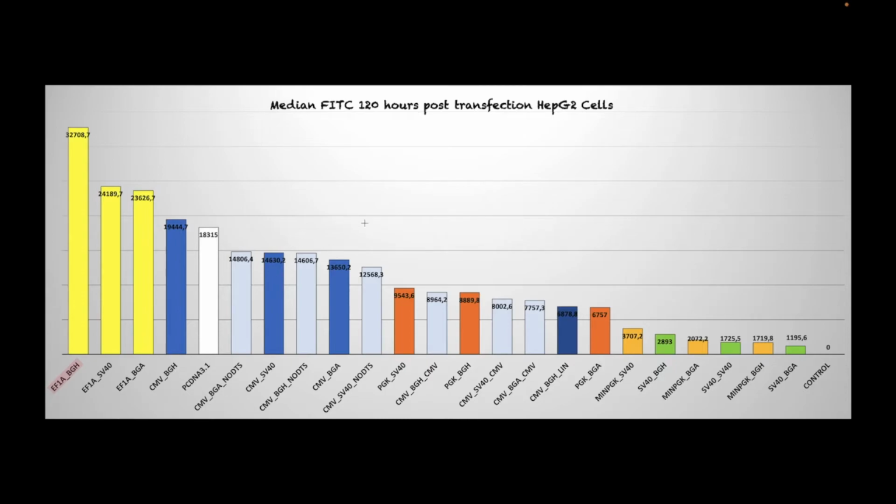Why is this the case? Well, I think because this DNA was linear, the cell silences my protein, basically the expression of my protein. So what this tells me is that I should not use linear DNA in the future if I want a good expression, at least.